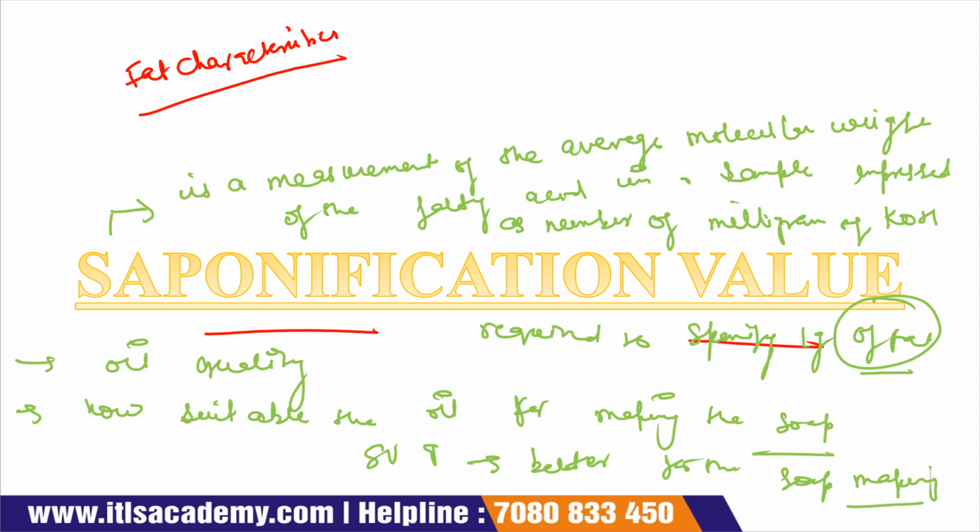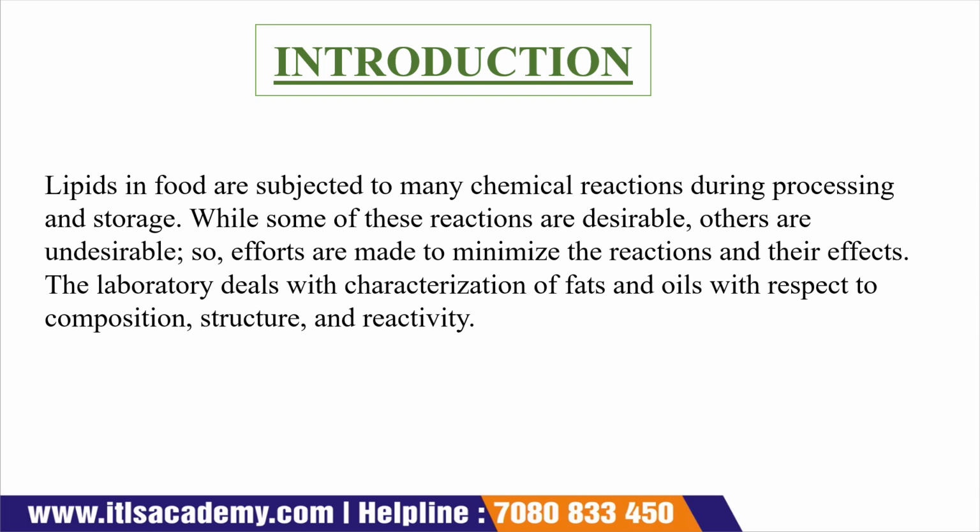Now come to the next slide, the introduction slide. We all know that the lipids present in food are subjected to many types of chemical reactions when stored or processed. Some reactions are desirable and some are undesirable, so we make an effort to minimize the effect of these reactions.